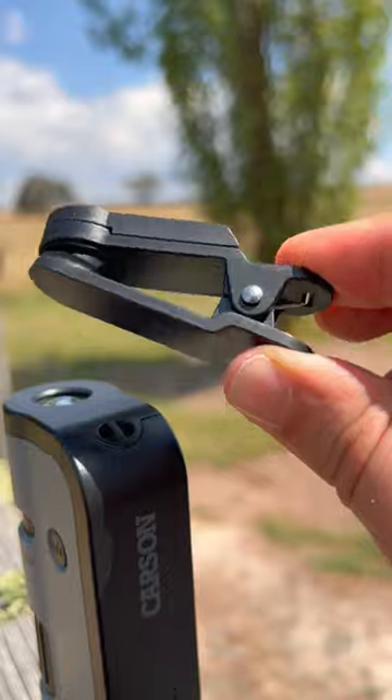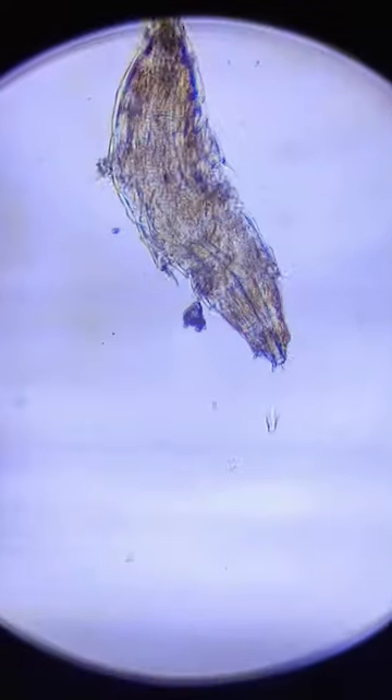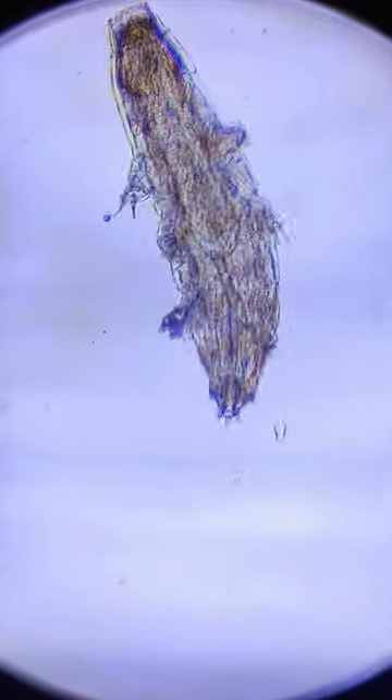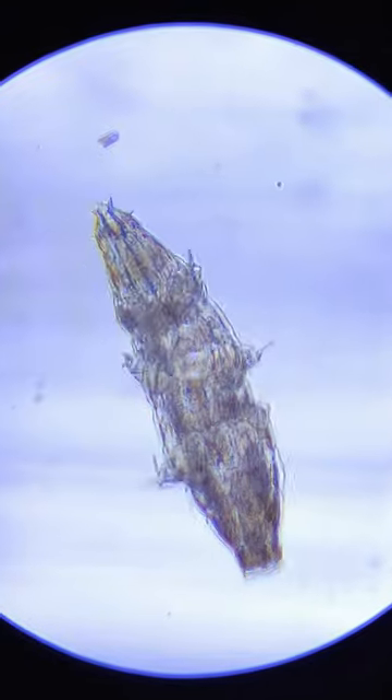It comes with a cool smartphone clip, so let me show you what it looks like. This is extremely impressive — the 100 to 250 times zoom resolves the tardigrades clearly. We can even see their cells! This is such an easy microscope to use and it should be part of your collection.